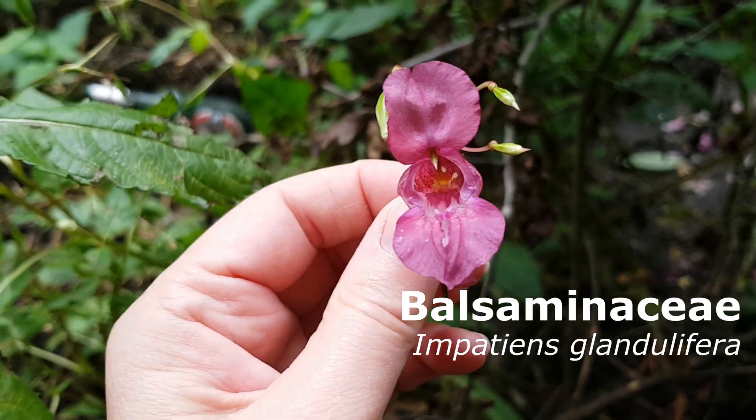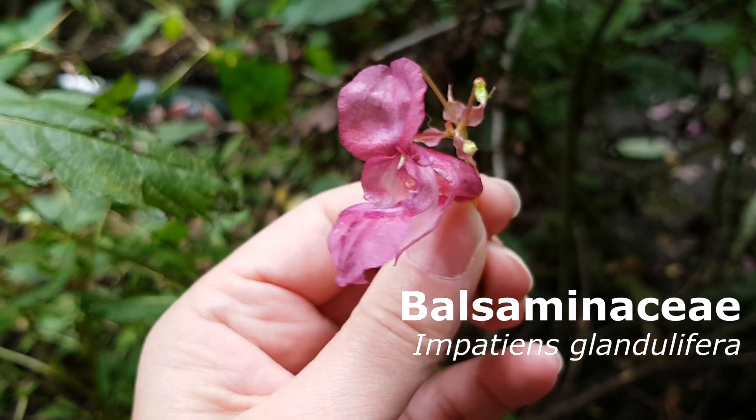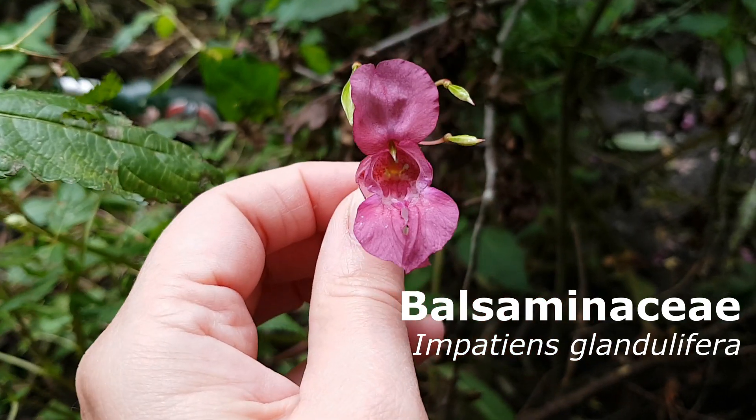Love it or loathe it, our bees go mad for dahlia and come back covered in it from top to toe. Let's find out what it looks like under the microscope.